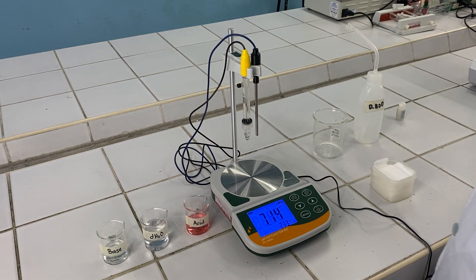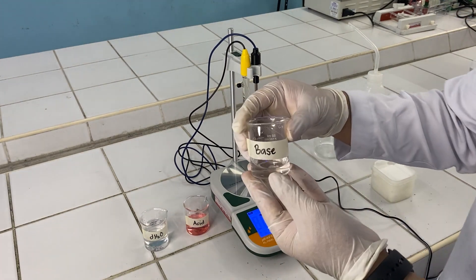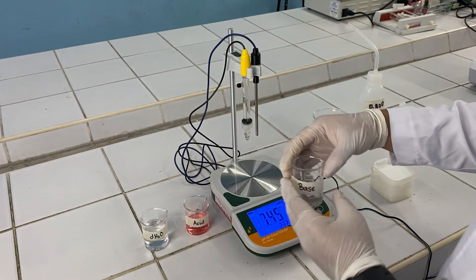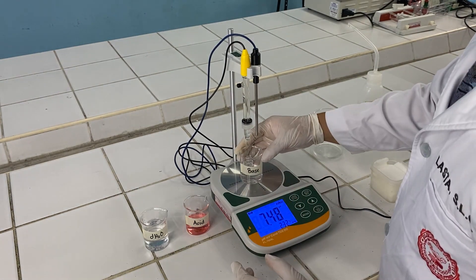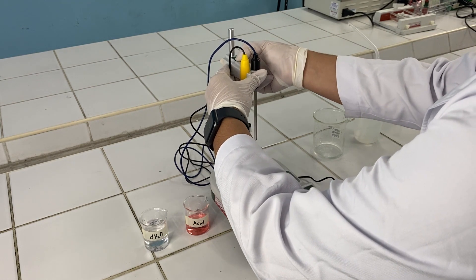After, you can then proceed reading your solution. Here, we will be starting off with the basic solution. Also, important to note that you should be using a pH meter that is already calibrated.